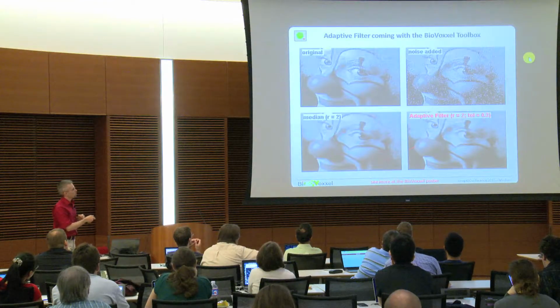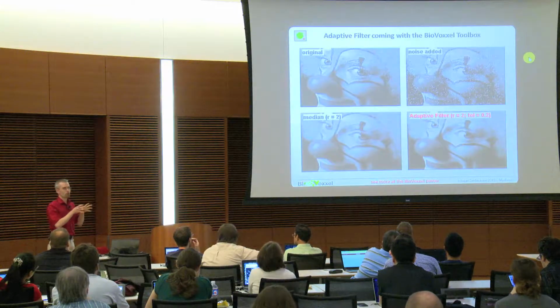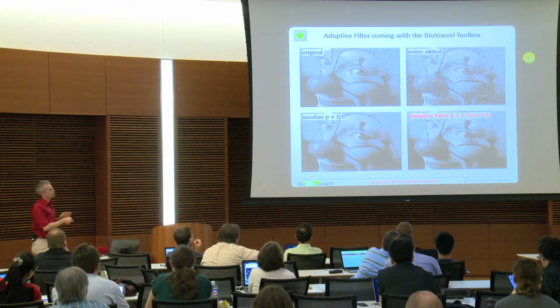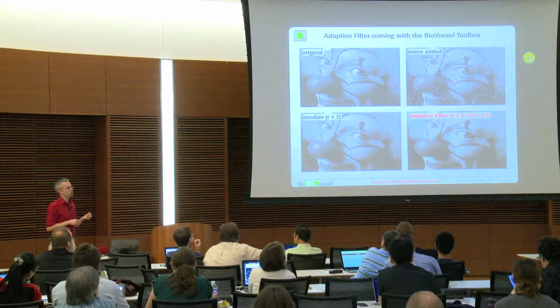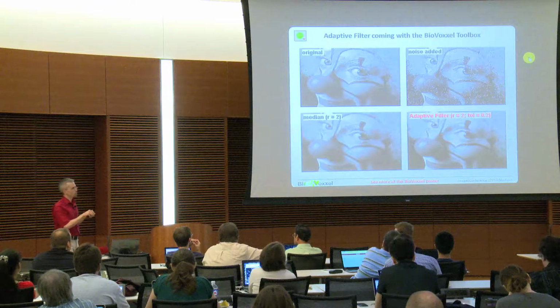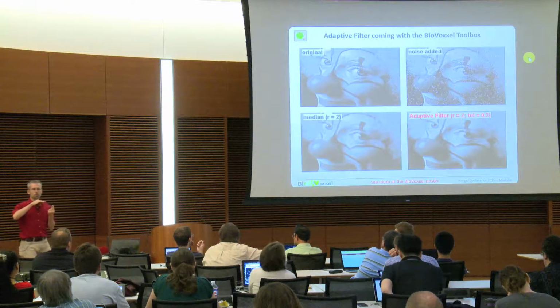So you see that actually here, but you also see in comparison to the original that after a median filter, the pixels are somehow grouped and you get rather a homogeneous or a blurring. And if you use an adaptive filter, the adaptive filter modifies that a little bit, because you can specify a tolerance, and the tolerance has the effect that it exchanges only those pixels which are above a certain threshold value.